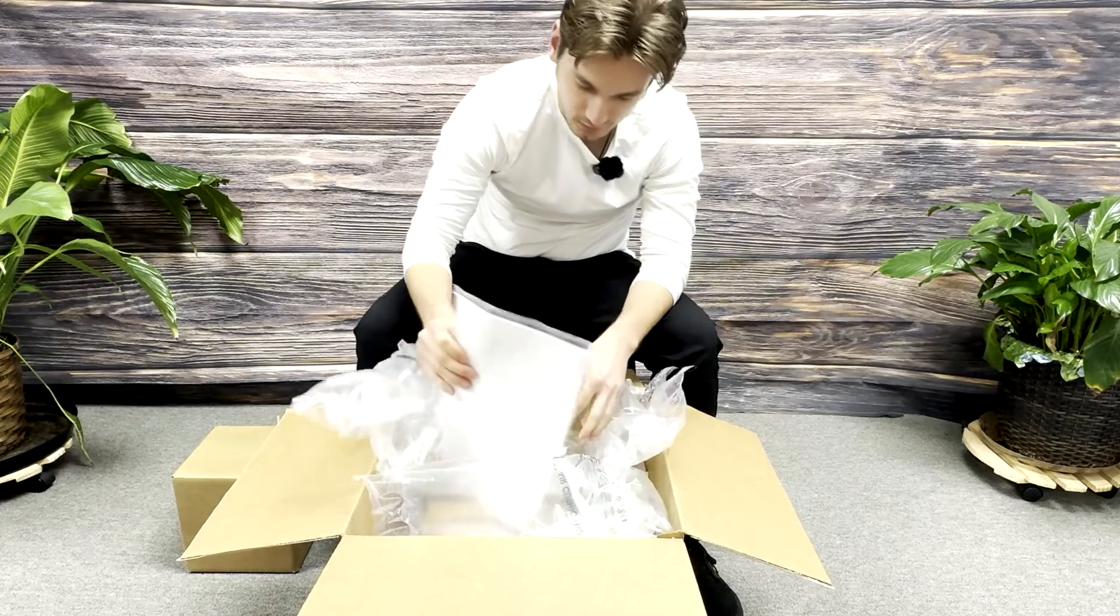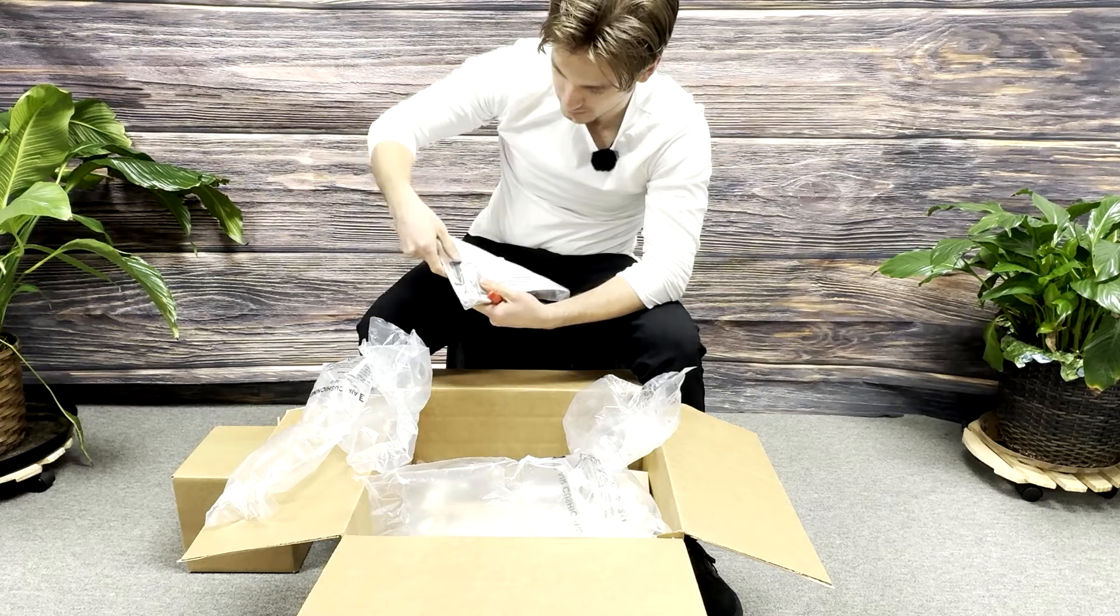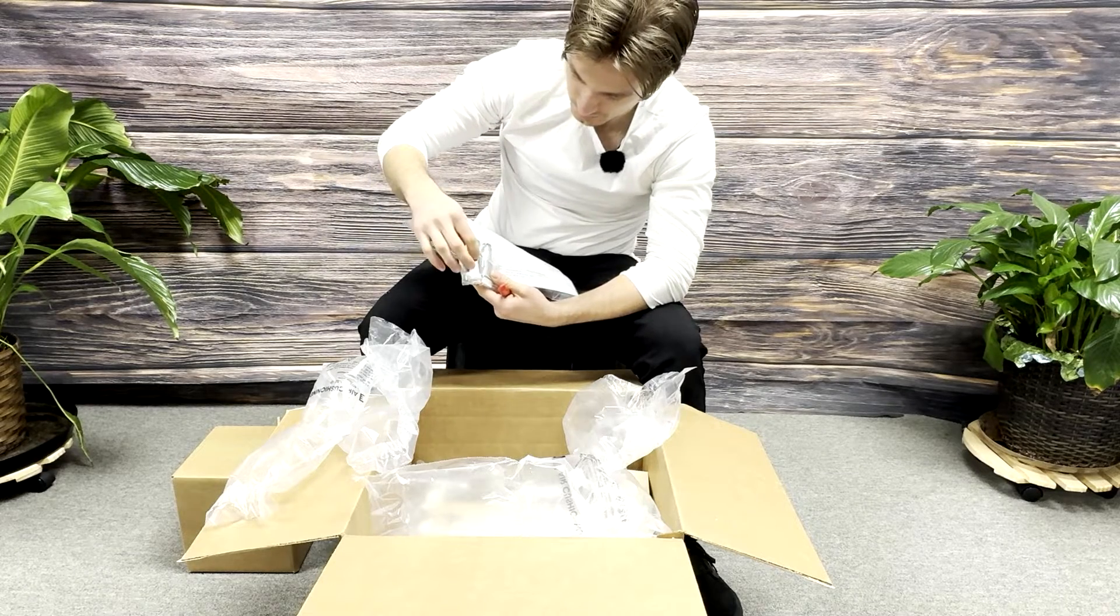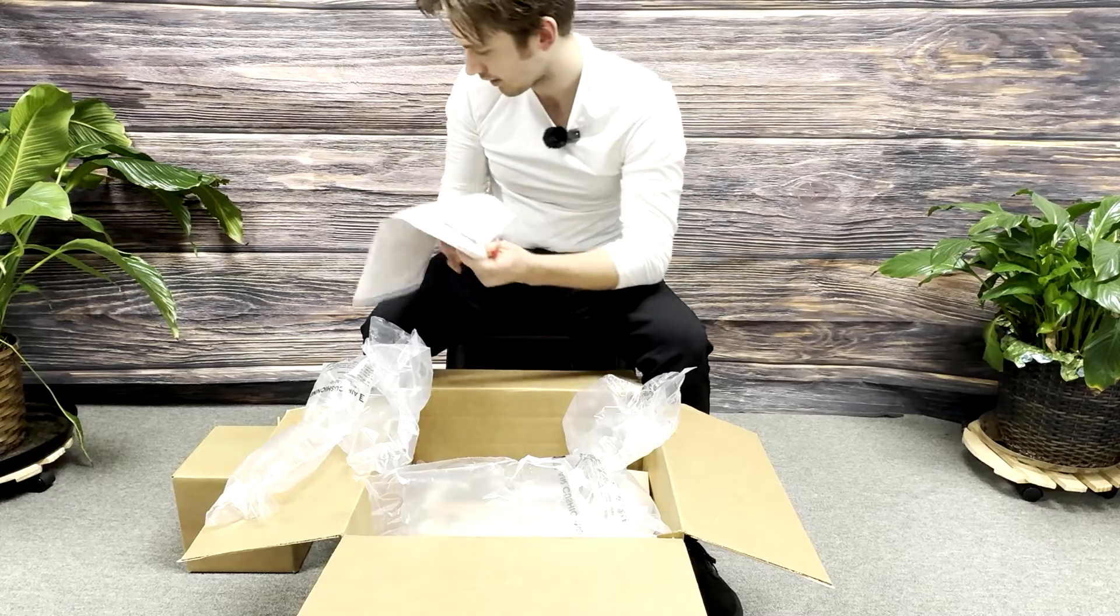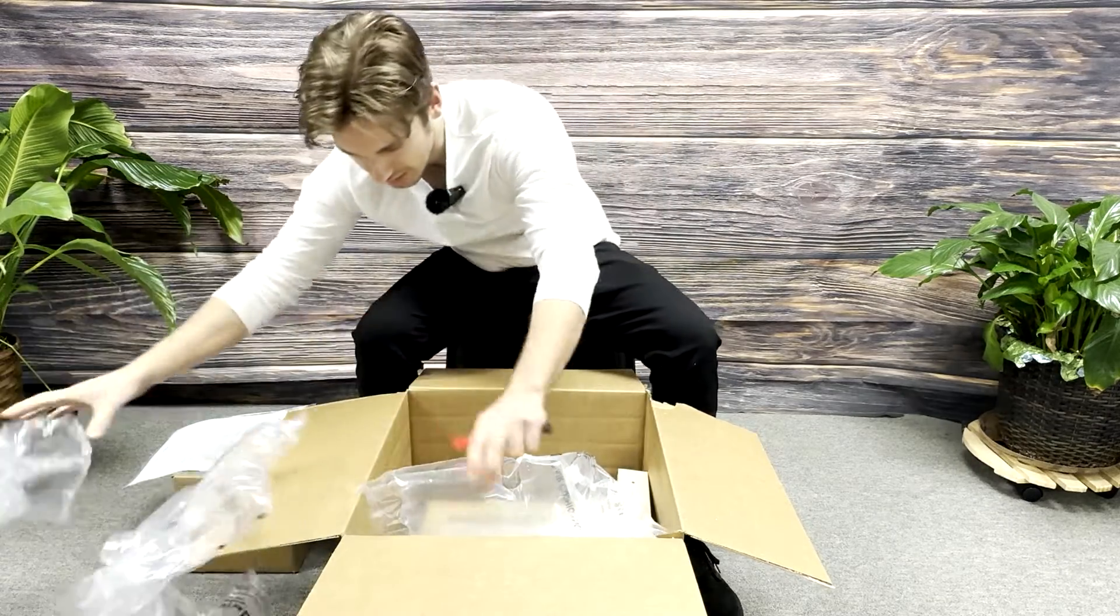It's going to include the screws, the pegs, and the silicone sealant as well. Go ahead and remove the air packaging keeping everything safe during shipping.